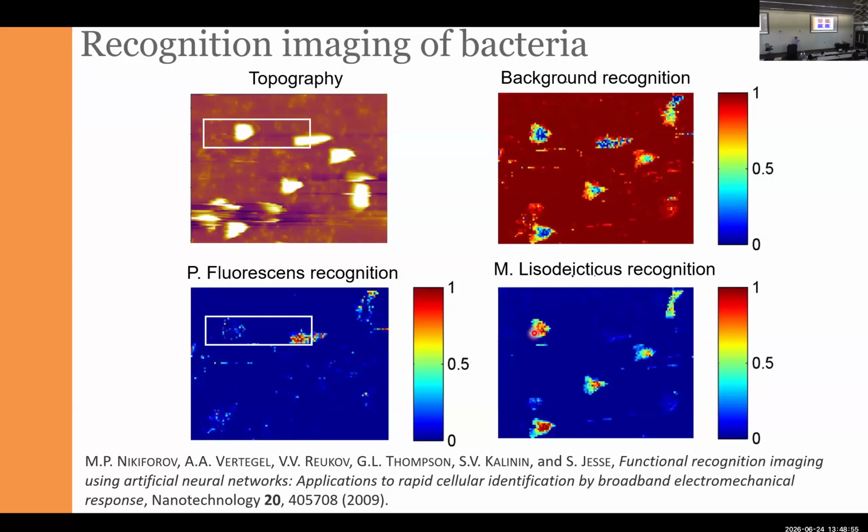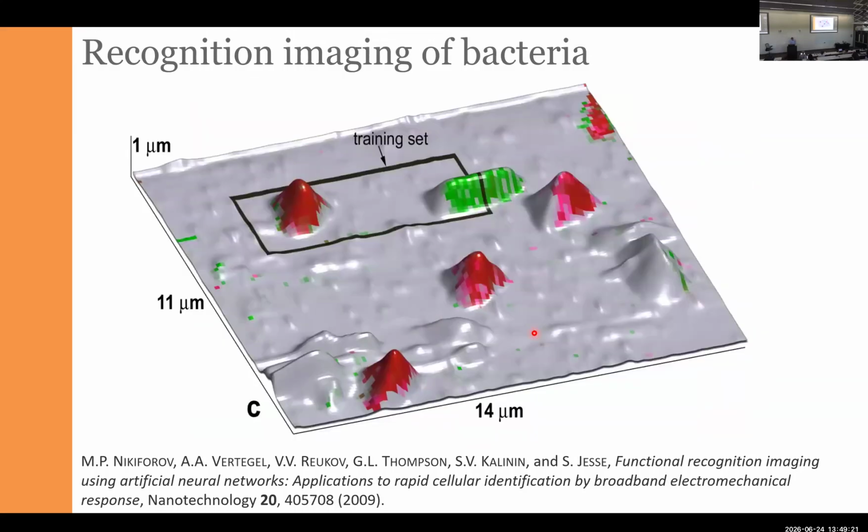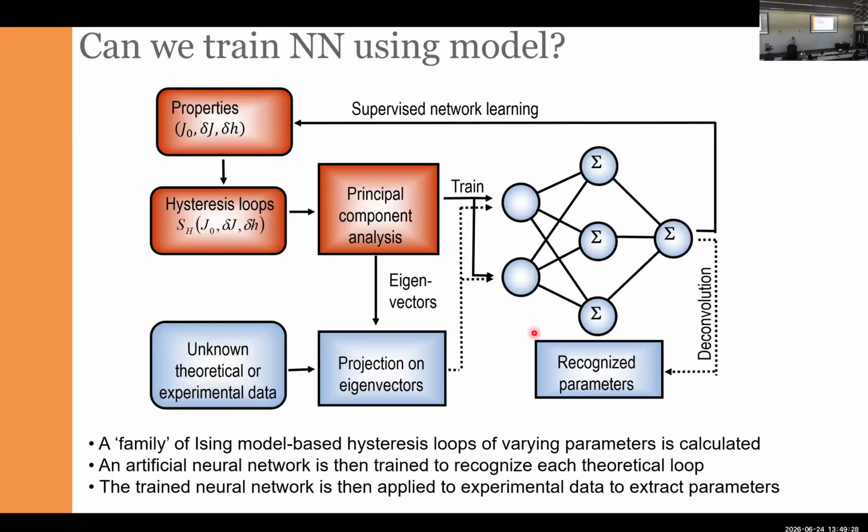So the idea is that once you deal with the microscopy data set, sometimes we have a lot of information in the XY domain, and we can use this information to form the labels in spectral domain. And then we can use the same type of spectral approach over the much larger domain and identify the unknown objects there. So the idea is to feel free to go forward between the different ways of labeling and different ways to analyze the new data sets. So this was a cool example exactly because in this case, the recognition measurements work.